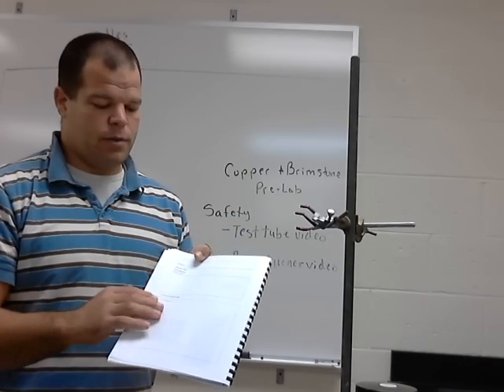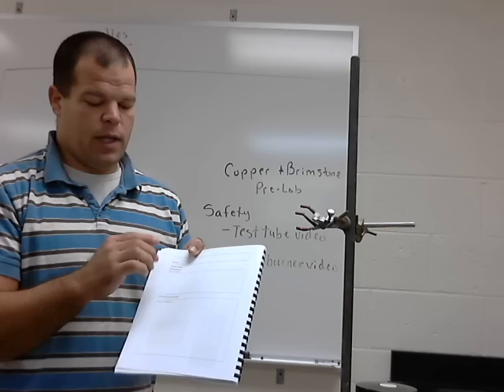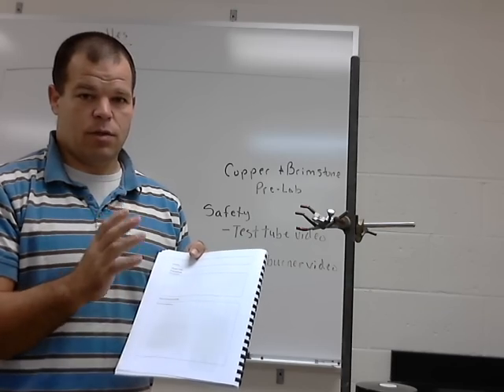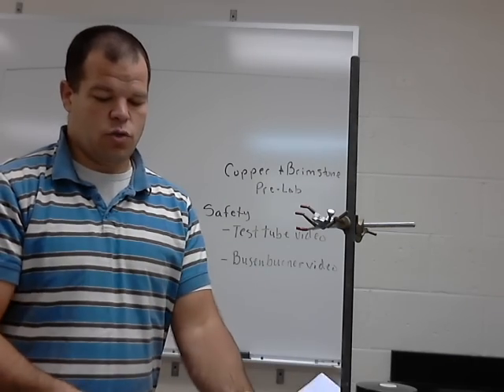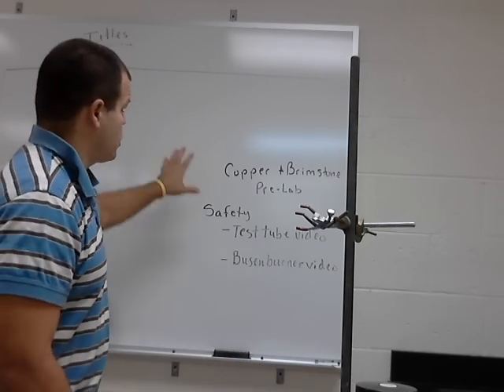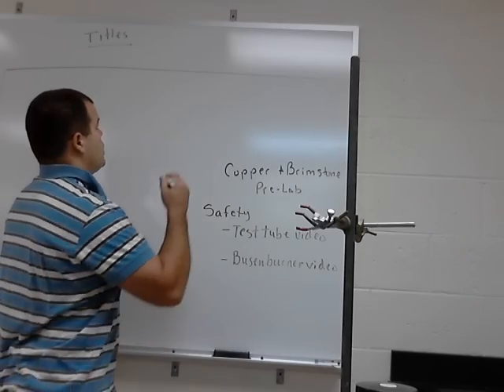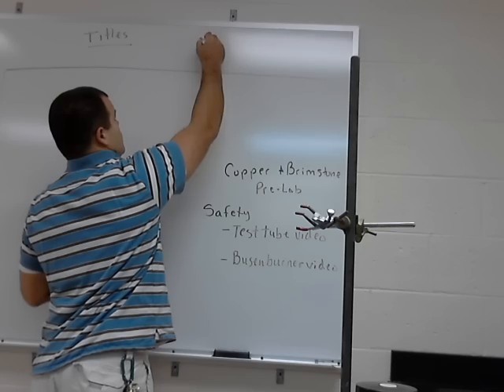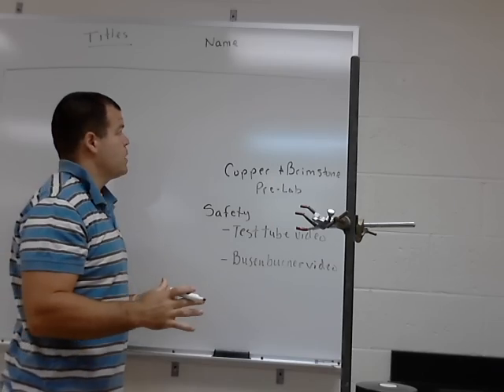When you show up to lab, you'll want to have your headings completed. I'll talk about that in a moment, and your procedure, and I'll talk about that in a moment as well. Read the lab over, and do the pre-lab. Okay, now on the board here, I'm just going to mention a few things as far as the pre-lab is concerned. One, it should be your name on the headings. This is just in your pre-lab, okay?